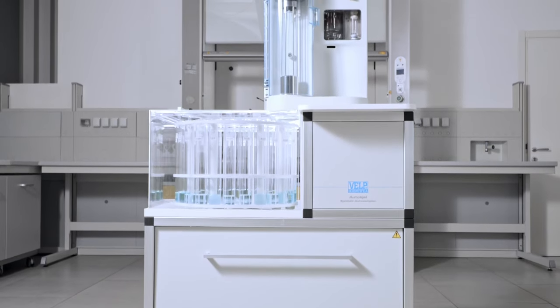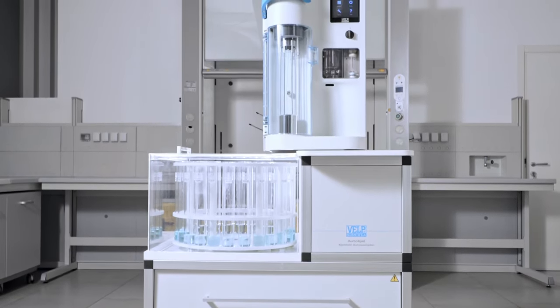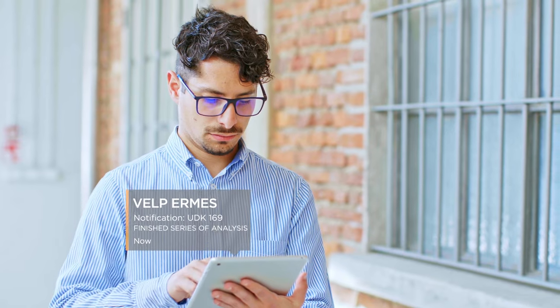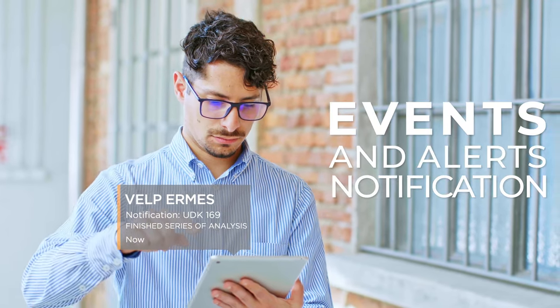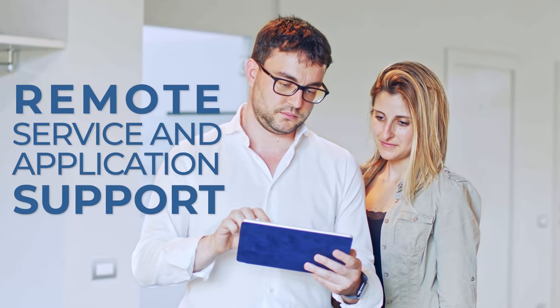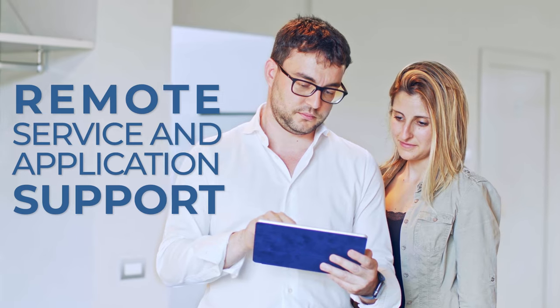Nitrogen determination reaches a new level with the VELP-HERMES cloud platform, the smart lab solution allowing real-time monitoring of your UDK169 wherever you are at any time. VELP-HERMES ensures UDK169 maximum uptime with remote service and application support.